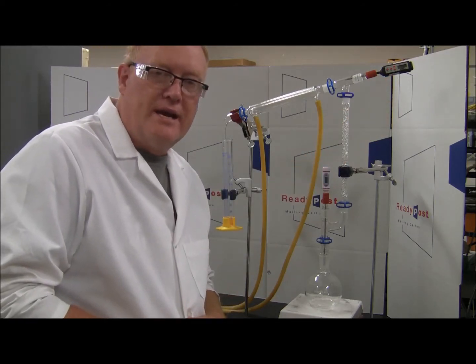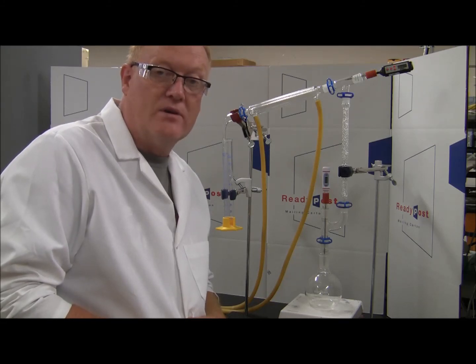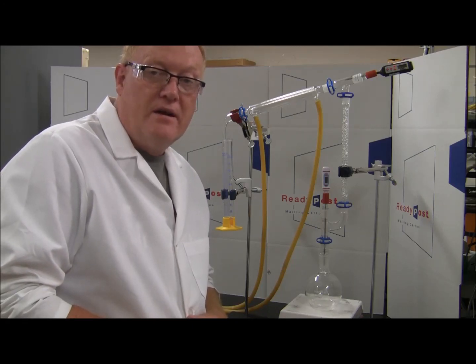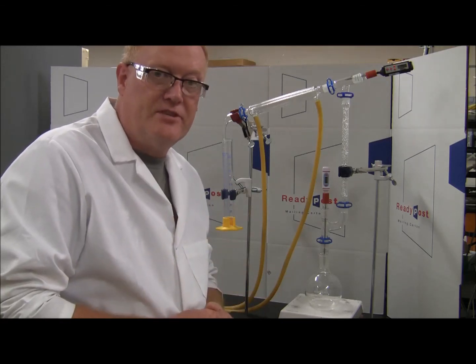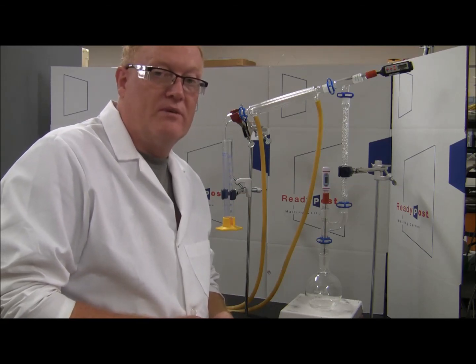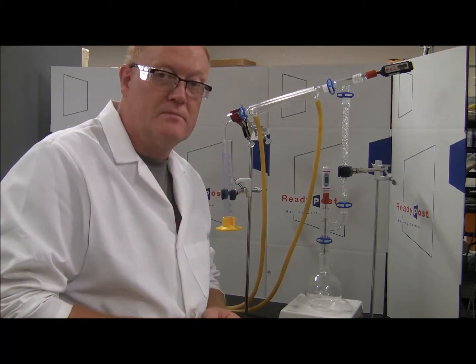We're taking a look at that. Ethanol boils at 173 Fahrenheit or approximately 78 degrees Celsius. And we're going to maintain that. You'll start seeing the temperature start rising. Once the temperature starts rising into the mid-90s, we're pretty much at water at that point, with this water vapor. So that's the time to cut off the experiment. Okay.